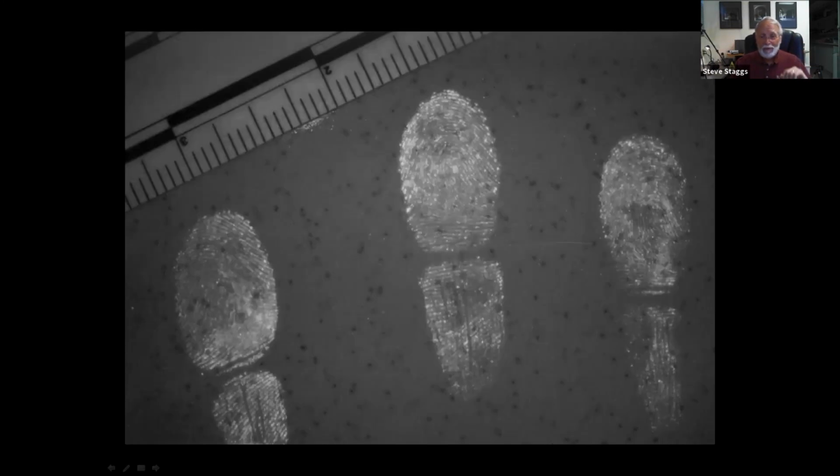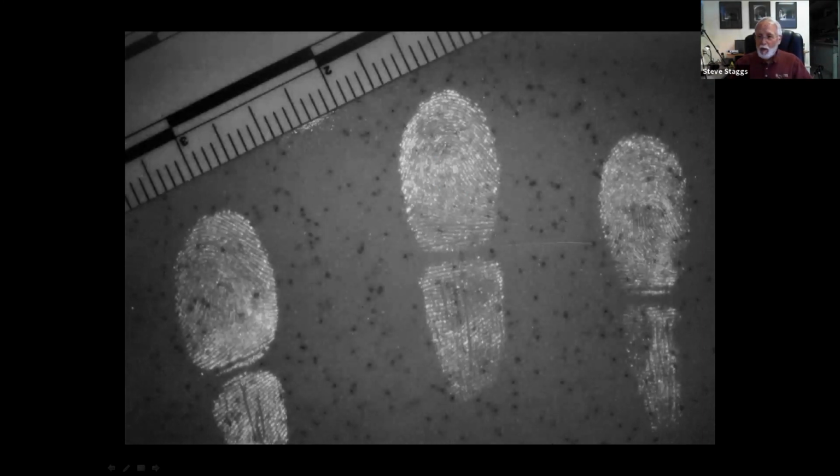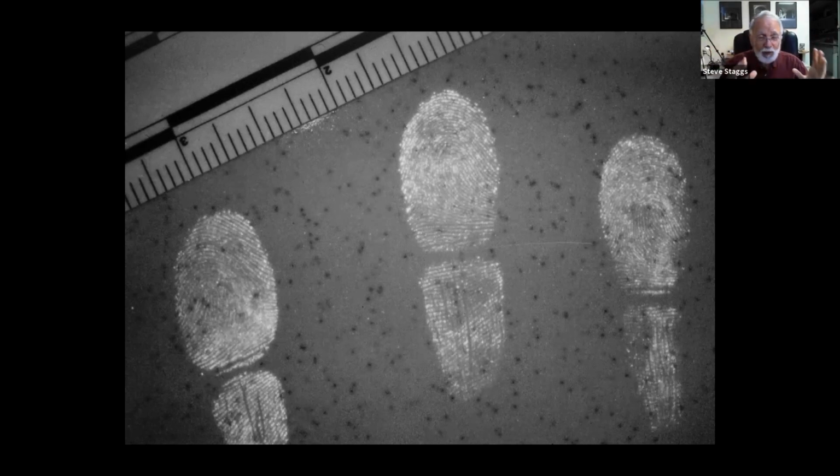That's the theory. So here is a black and white photograph of fluorescence. This was a tile with kind of multicolor to it. I dusted it with a fluorescent powder, hit it with the alternate light source, and put the barrier filter in front of the lens. Because remember, when you're photographing something, you're just repeating for the camera what you did to be able to see something. So for me to be able to see the result, I need to put the barrier filter, my goggles, on.